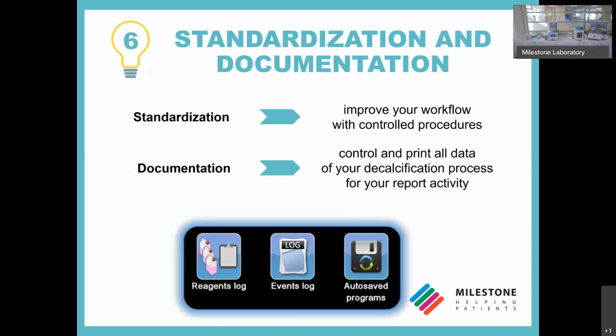From the tips we have seen so far, it's easy to understand that decalcifying a sample is a bit like following a cookie recipe. You need to use the correct ingredient, the reagent, you need to set the correct time and temperature to ensure standardization in execution regardless of the user. Once the recipe has been standardized, the documentation of the execution is essential to find the data relating to a decalcification. That's why I suggest you have a tool which provides you with a report of your process activity.